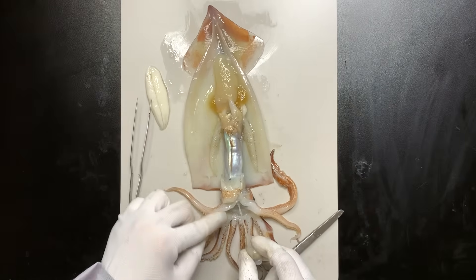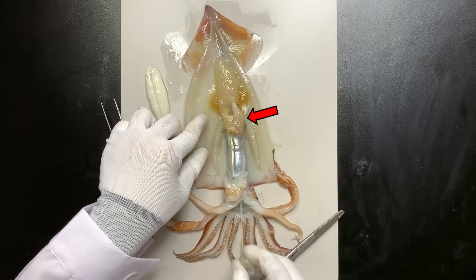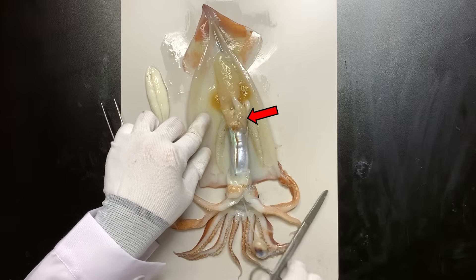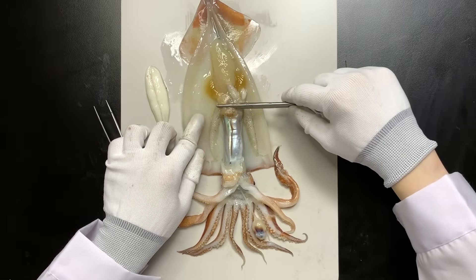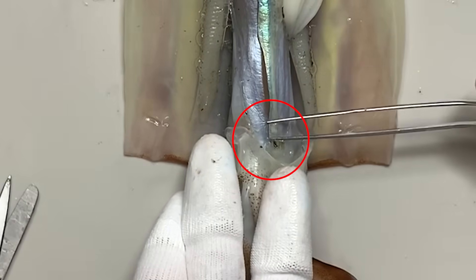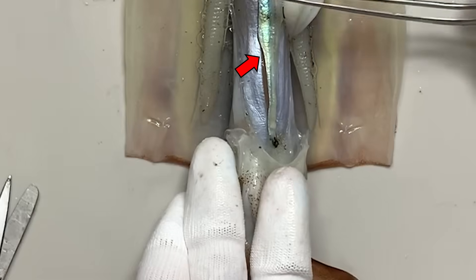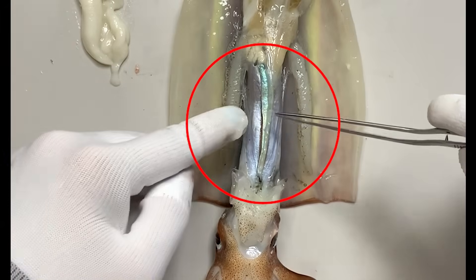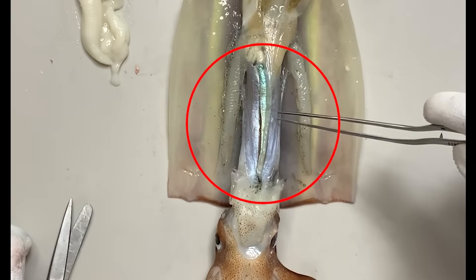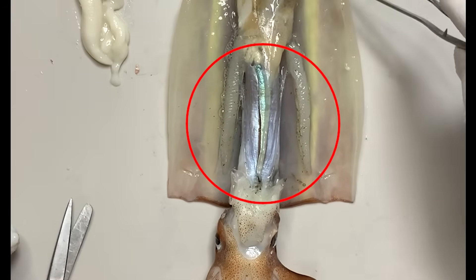The digestive tract is in the upper body, so food goes up, is digested, and waste exits from the bottom. If you press on it, you'll see the waste come out — this is the anus. The ink sac is right next to it, so be careful not to break it. The largest organ in the middle is the liver. It's thought that the squid's liver helps it float instead of using a swim bladder.